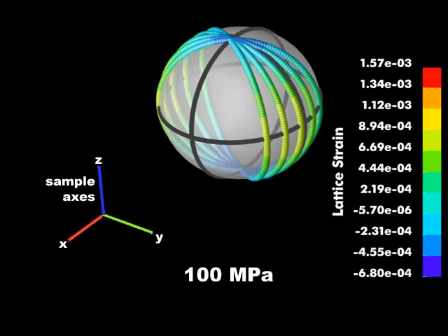Here is lattice strain data measured from the tensile loading direction of an iron-copper alloy, measured along the sample y-axis at Cornell's high-energy synchrotron source. Data from the 200 family of planes in the copper phase are shown. The coverage pattern of the lattice strain pole figure was obtained using 5 positions of the load frame as shown previously.